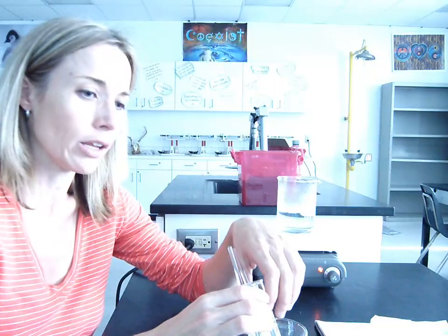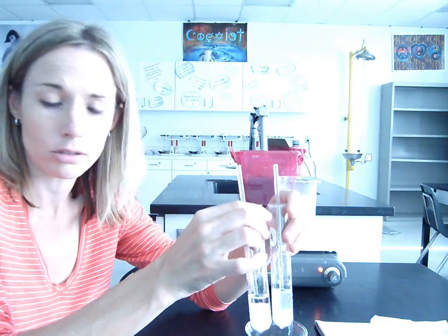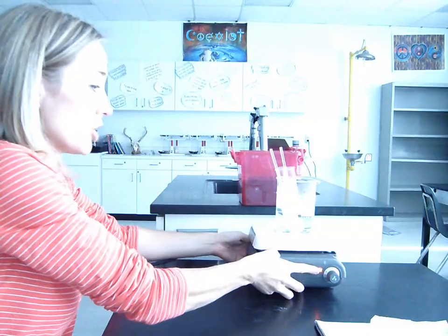So one of the nice parts about this lab is that it's not actually quantitative. We don't have to take measurements, so it makes it go a little bit faster, and we just get to kind of watch and see what we see. All right, so again, for your first data point in terms of your observations, neither substance appears to be very soluble at room temperature. Now we're going to heat them up and see if heating them up changes anything.